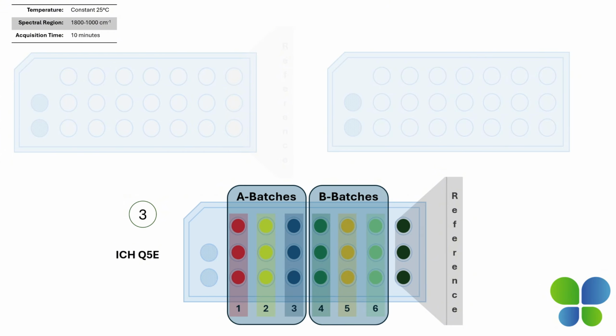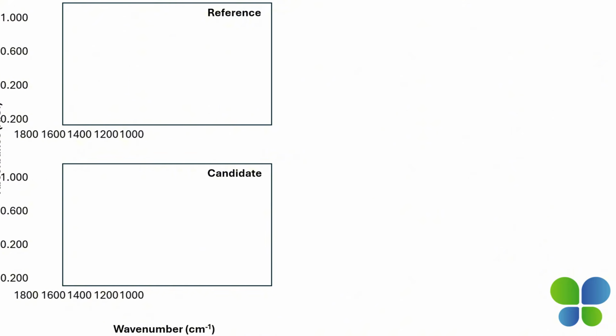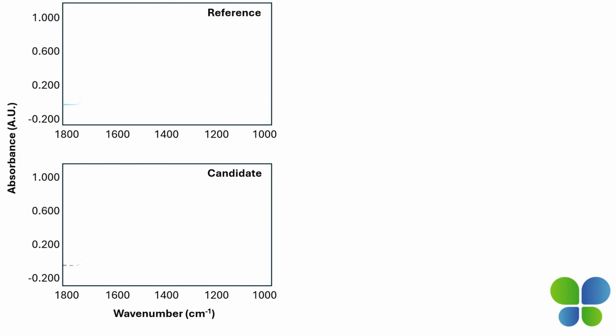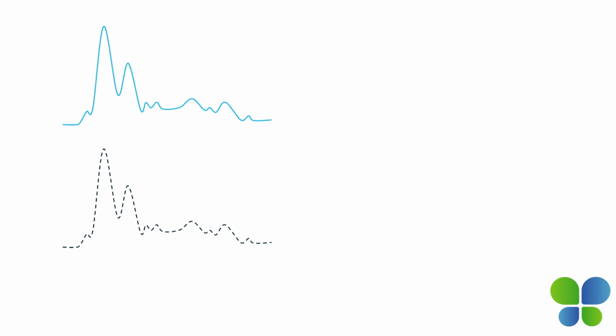Our method involves the comparative analysis of weighted difference spectra for the reference standard against a drug substance or drug product. We typically determine the Euclidean distance at each wave number within the spectral region of interest to evaluate the two weighted spectral overlay differences and report the results in a table format along with the standard deviation.